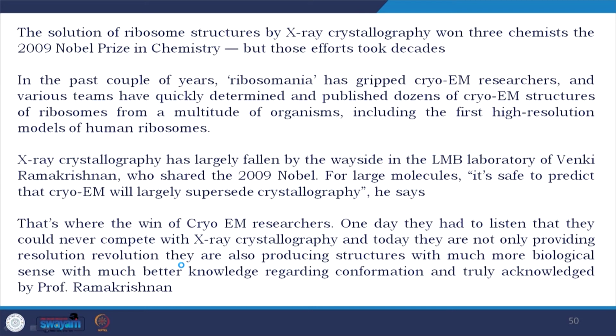One day, they had to listen that they could never compete or supersede X-ray crystallography, that they would be a niche and all, and today they are not only providing the resolution revolution at the level of X-ray crystallography, they are also producing structures with much more biological sense, with much better knowledge regarding conformation, regarding activity, regarding its connection to biology, and now it is truly acknowledged by Venki, a crystallographer, that this technique has gone so far and now established itself as one of the most prominent structure solution techniques.